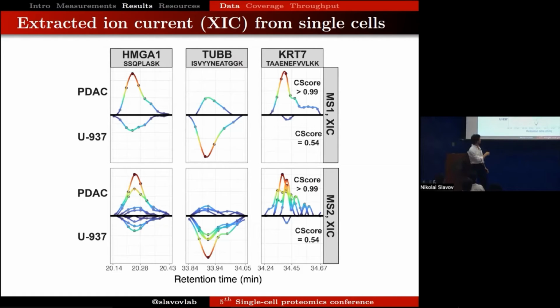And we can trace the elution curves of the fragments of this peptide. And you can see that their retention time coincides with the retention time of the peptide. And this can give us confidence in the identification.